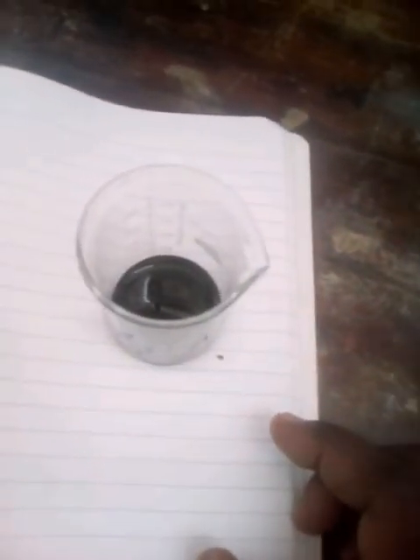We already knew that based on the result, but we confirmed it by doing a confirmation test, reacting the mixture from our test tube with starch suspension, and we are getting a blue-black color change. So we are now certain that iodine was formed in this reaction.